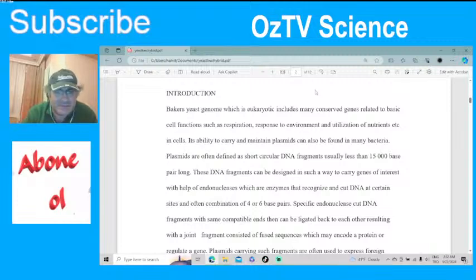So let's start with the experiment. Let me just read this fast. This is my writing, my report. Baker's yeast genome, which is eukaryotic, includes many conserved genes related to basic cell functions such as respiration, response to environment, and utilization of nutrients, etc. in cells. Its ability to carry and maintain plasmids can also be found in many bacteria. So far, very easy.